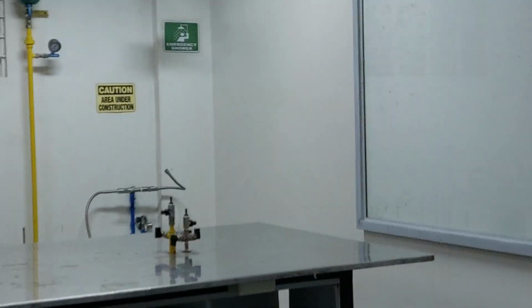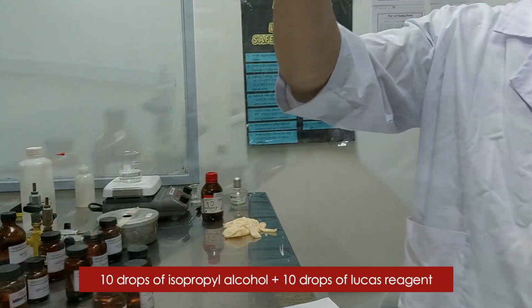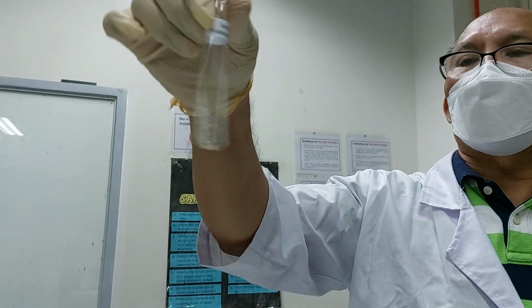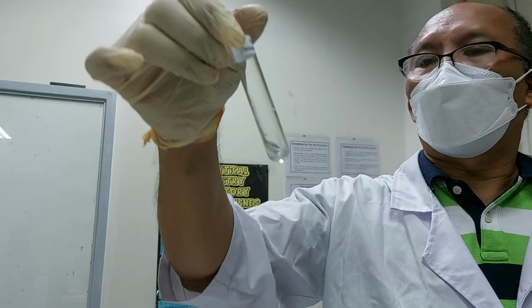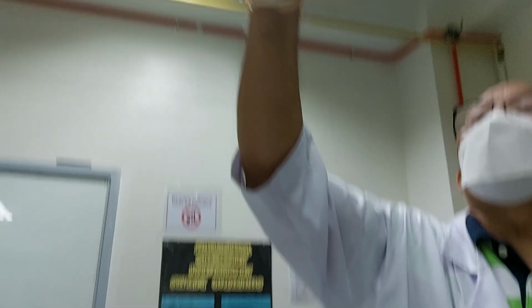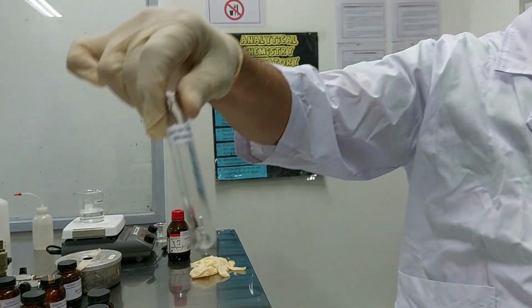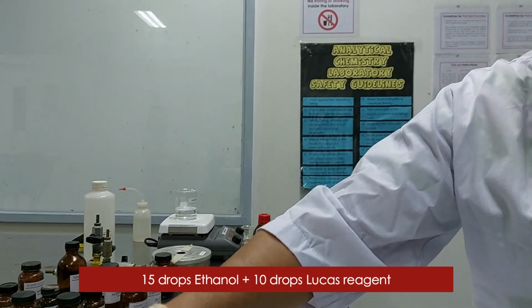So you record the time. We'll let it stand. Theoretically, supposedly after 5 minutes. So let's go to secondary alcohol. Let's start the time for this one. We'll let it stand also, and see which one is longer, isopropyl or tertiary butyl. So let's check our tertiary butyl. There's no layer yet. So let's go to primary alcohol, ethanol. We let it stand.